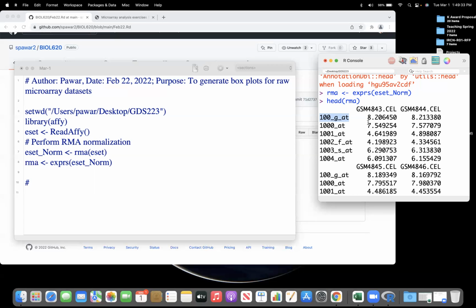So I have sample 1 and sample 2, and I get a fold change, sample 1 divided by sample 2. The fold change numbers vary from 0 to minus infinity and 0 to plus infinity. I have a threshold, say +2. Anything above +2 is interesting for me, and anything below -2 is interesting for me. That is something we'll be looking at in that platform ID. Fine? Good? So that is what we want to do in this example.